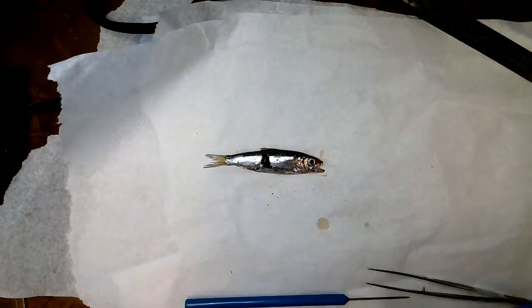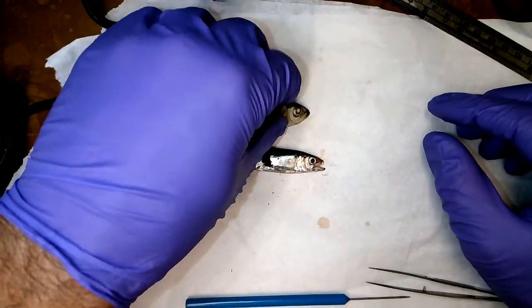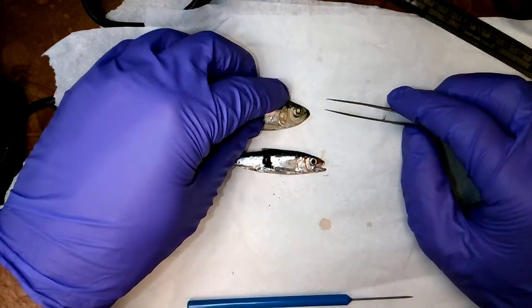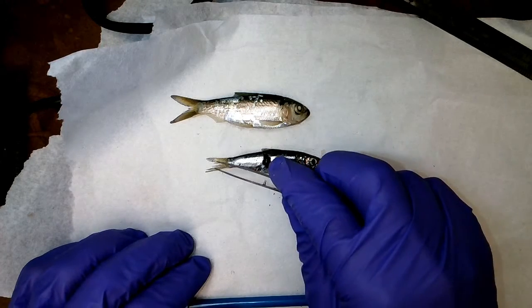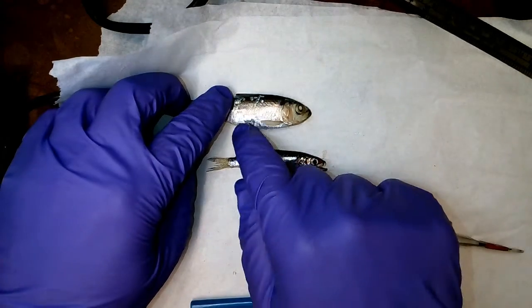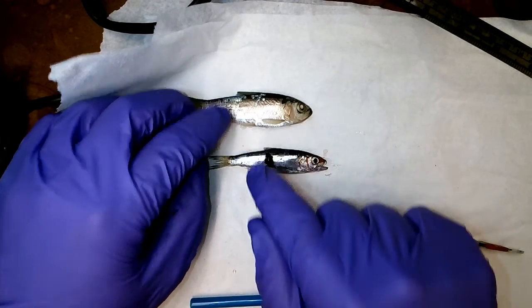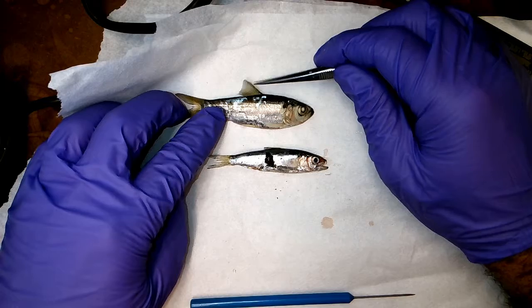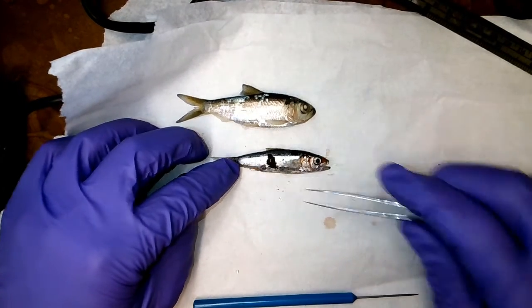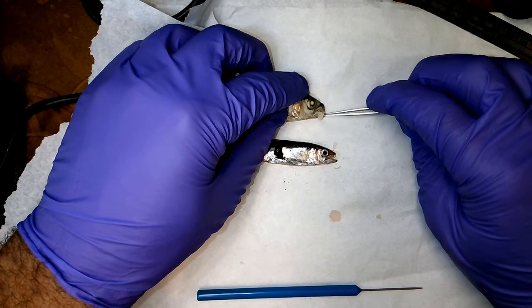For comparison, let me take out what I know is a river herring. Okay, a lot of similarities: forked tails, scutes on the bottom, on the ventral side, similar positions of the dorsal relative to the pectoral fins. But let's open up the jaw now of this river herring.